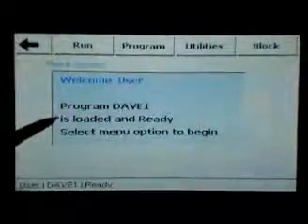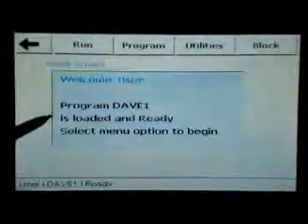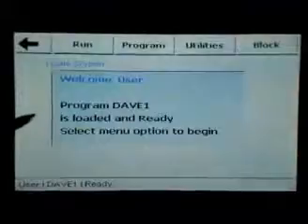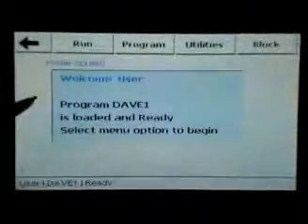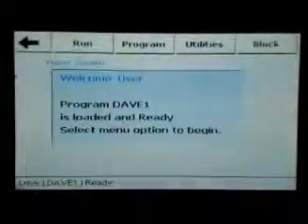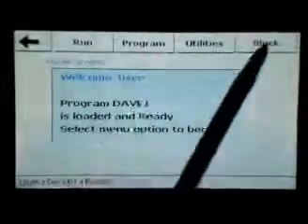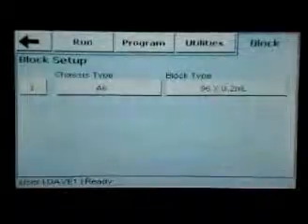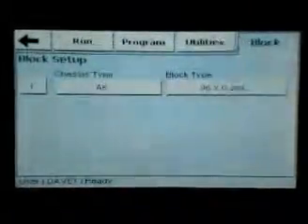Quite often when you use your thermal cycler, you run the same program over and over, and we've set this up to be convenient where you can immediately go directly to the run button, put your samples in the machine, and you're off and running. But let's assume this is the first time you've used this machine, and let's walk you through a couple of the other steps. You'll notice up here the block button. When you push that, that just confirms what type of chassis you have. This is an Amplitronyx 6, and the type of block in the machine.